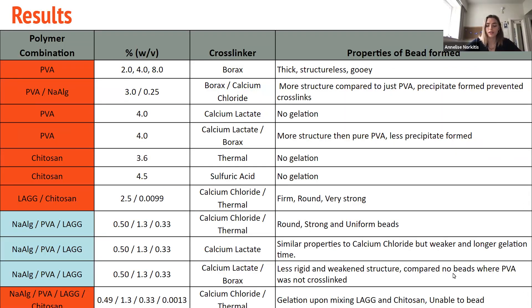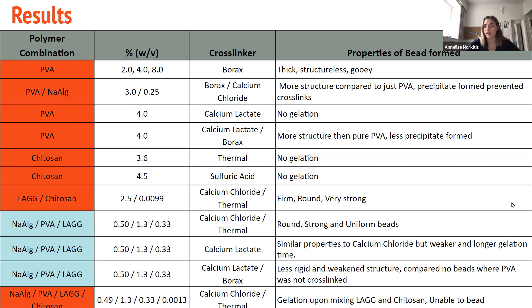We first started with PVA gel beads, but moved on because the beads did not have enough structure and turned out very gooey and thick. We then did research on different polymers and tested chitosan, low acyl gellan gum, and sodium alginate. The chitosan beads did not gel at all, so we moved on from that. Low acyl gellan gum and chitosan did gel, but did not have all the properties we wanted. We also tested a mix of sodium alginate, PVA, low acyl gellan gum, and chitosan together, but unfortunately when these were mixed together they gelled prematurely and were unable to form beads, instead forming one large thick substance.